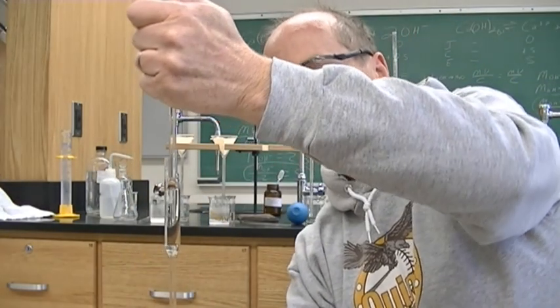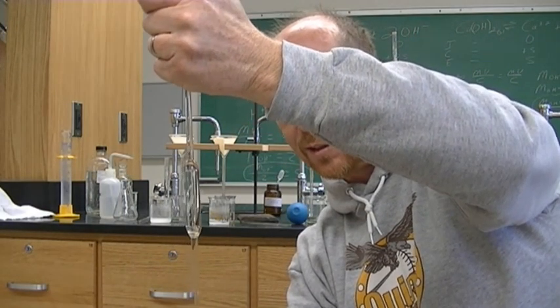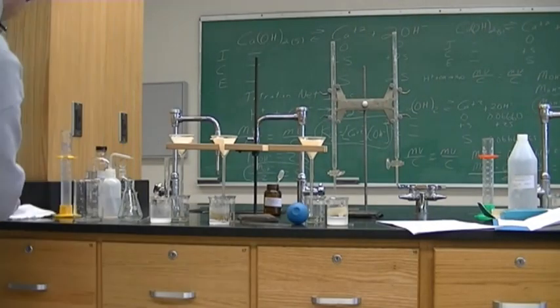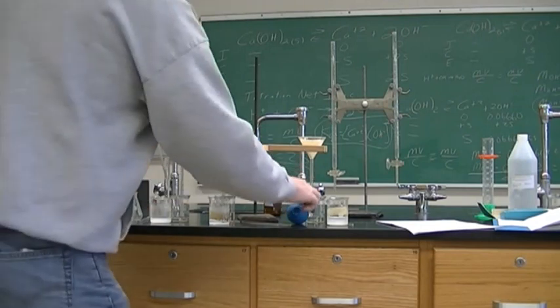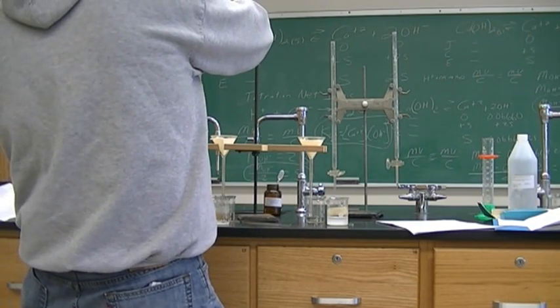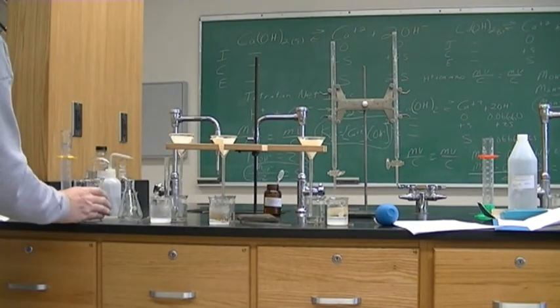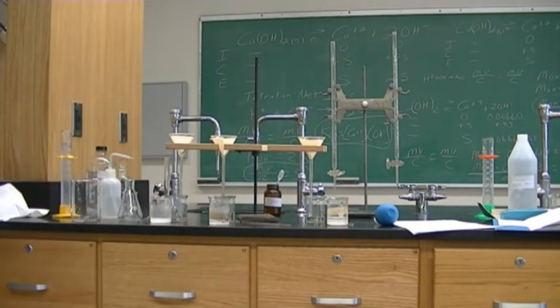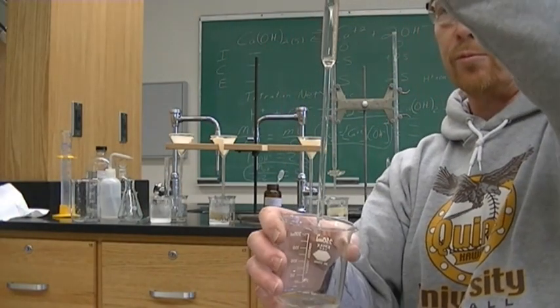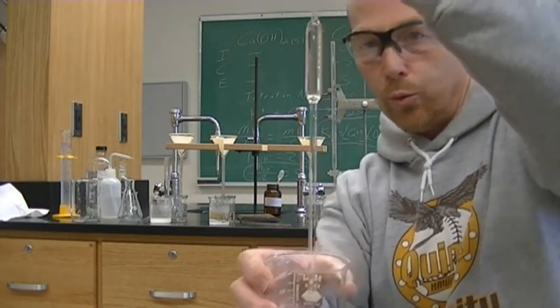So it does take some practice, and I am a little out of practice. I can't remember the last time I did one of these. Like I said, I am out of practice. To get that to fall at the exact rate that you want it to is difficult. At least I am proving my point here that we don't like to use these. We would prefer, okay, so I need to, it has to go down smooth.